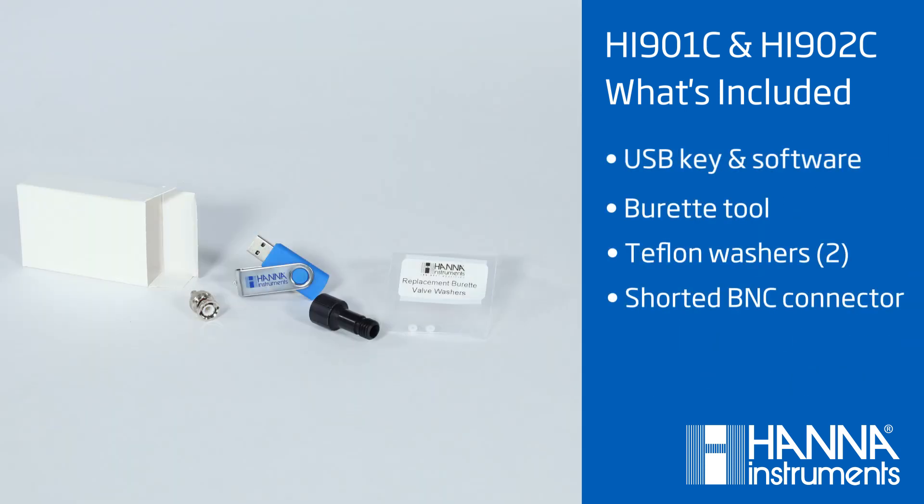And in this very small box, you'll find a USB key with PC software, the burette plunger removal tool, two white Teflon washers, and a shorted BNC connector.